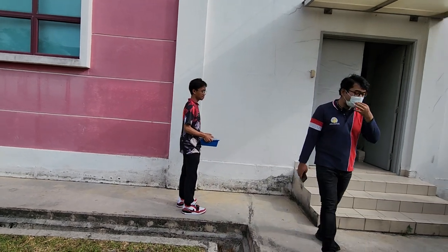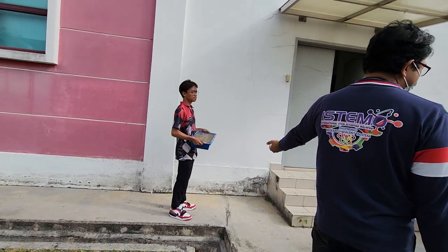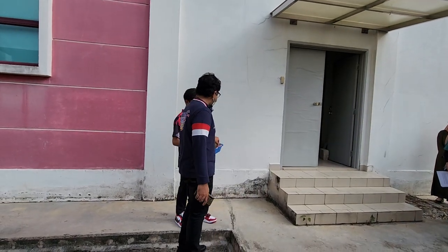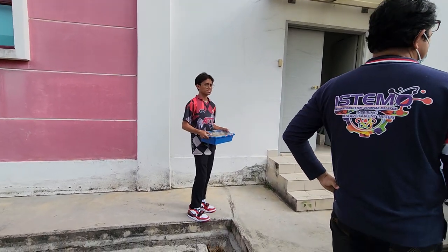Okay, so you're going to place this over here. Full of sunlight, right? Yeah. So someone from the group needs to come to check on your plants, to water it, to make sure that it's germinating properly. The moment it has started to germinate, you can remove this. Yeah, this is corn. Maybe after 4 days also, right?